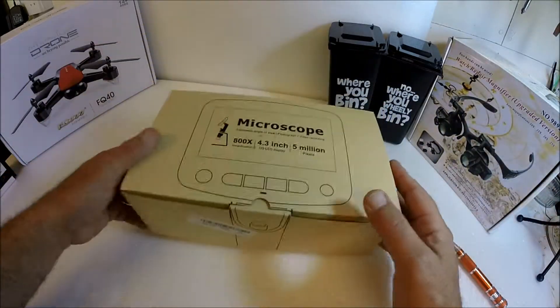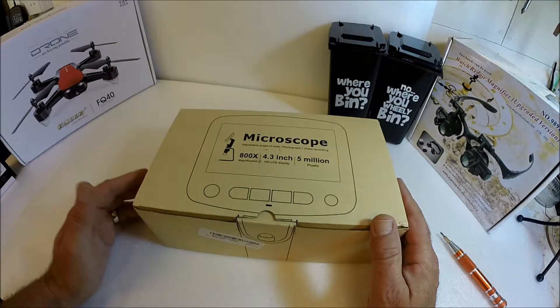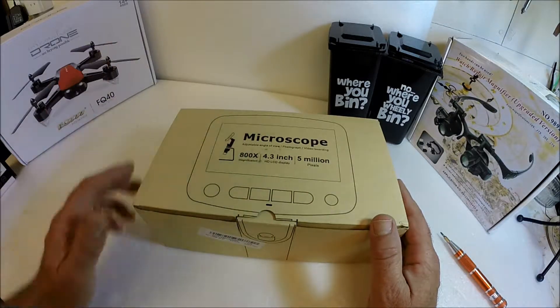So let's open this up, see what we get in the box. I'll put it together and I'll briefly go through the functions of the microscope.